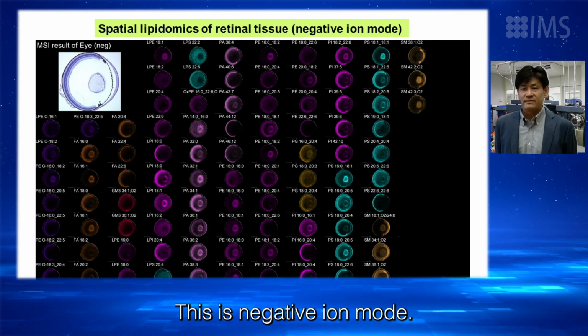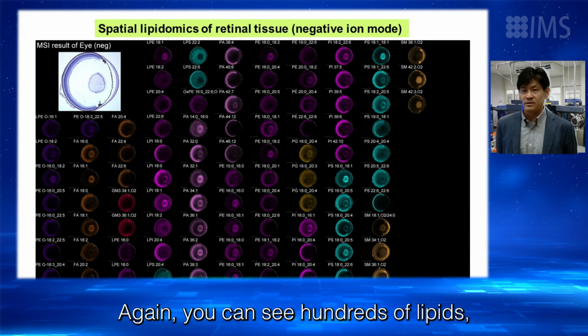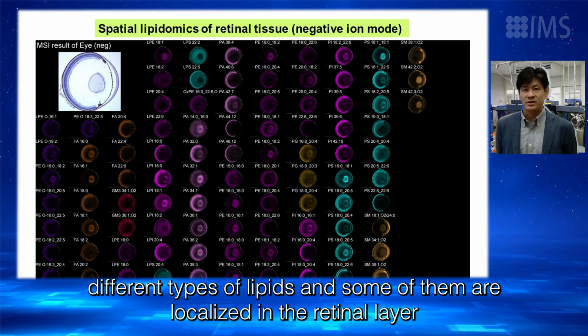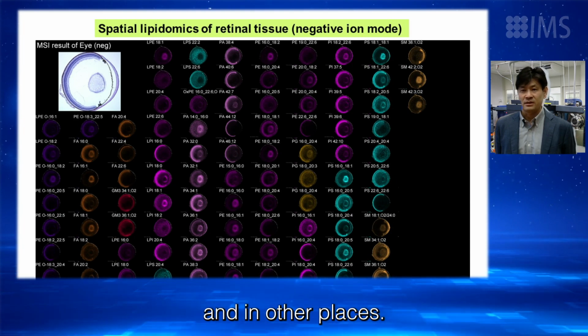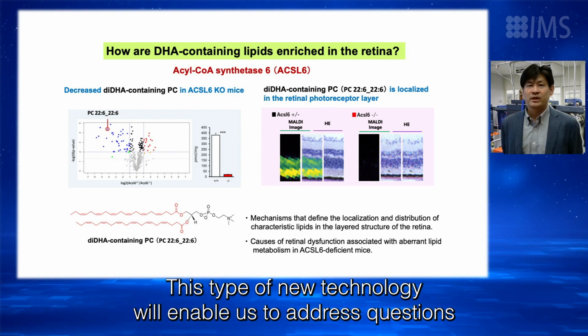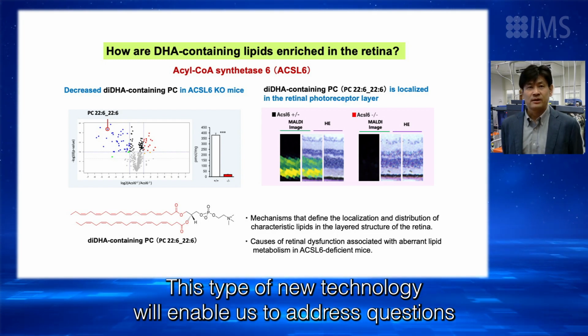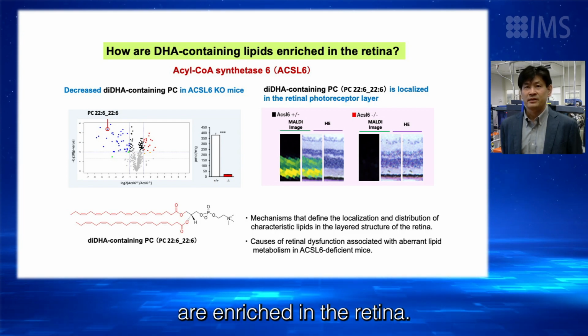And this is negative ion mode. Again, you can see hundreds of different types of lipids, and some of them are localized in a retinal layer, and the others are in other places. This type of new technology will enable us to address a question like how DHA-containing lipids are enriched in the retina.